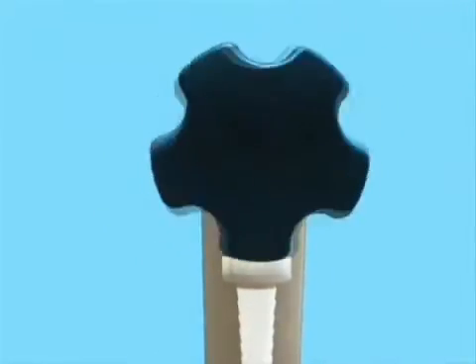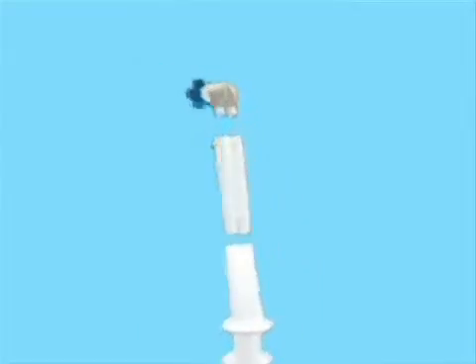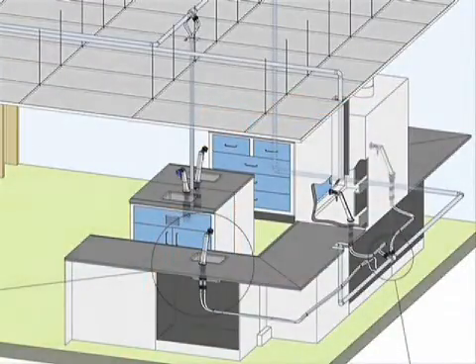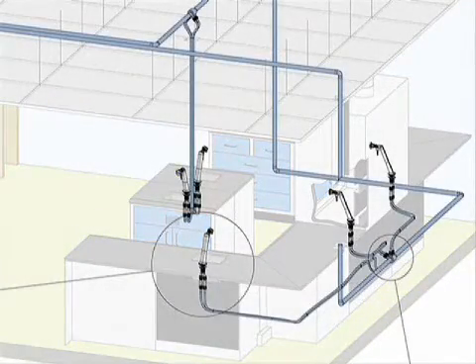The new GF Piping Systems AquaTap recirculating laboratory faucet, together with GF's patented inline flow diverter or IFD technology, is a significant advancement in laboratory DI and pure water distribution systems. The AquaTap faucet is specifically designed to provide a true recirculating faucet in laboratories designed with a serpentine distribution piping network.